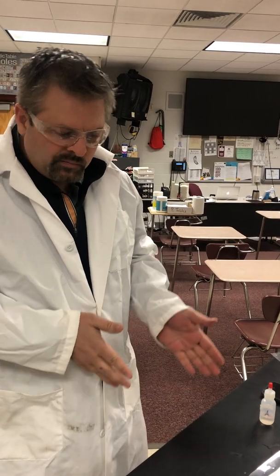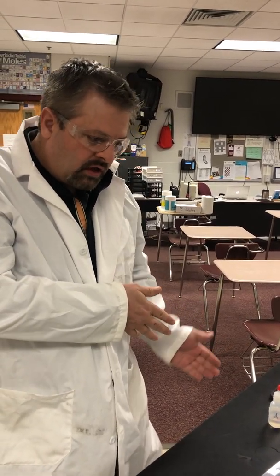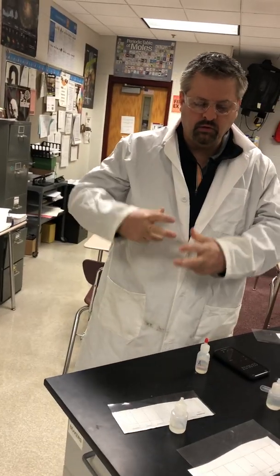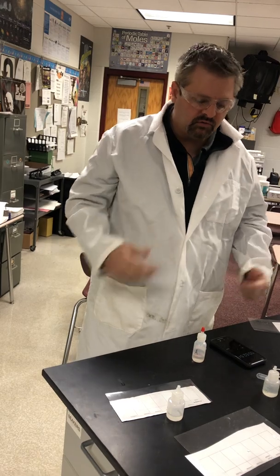And remember that one, it kind of messed up. The exact time is not super important because we're comparing the relative rates of evaporation, so that's why I didn't really go back and redo that. But we could see whether it evaporated more quickly than the regular ethanol or not. Those are things you want to think about, and then relate the evaporation rate and the drop shape to the strength of the intermolecular forces. Then think about which force is the weakest. Is it hydrogen bonding? Is it dispersion? Is it dipole-dipole? The really strong ones are going to be the strongest force, and the really weak ones are going to be the weaker force.